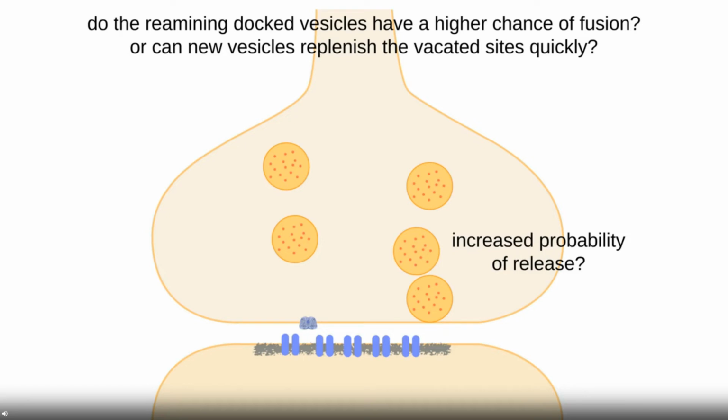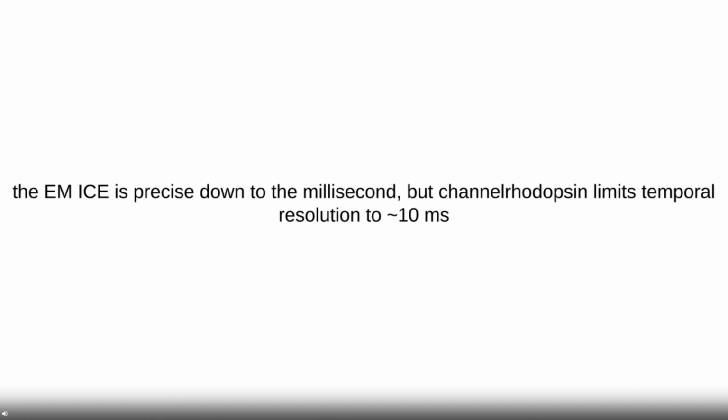So what we thought about is, in principle, a very simple idea. Well, what if you just have recovery of vesicles that's quicker? You have vesicles that dock in really quickly. But again, this isn't what Shigeki saw with his experiments, right? Docking took about 10 seconds to come back. But here again, we come to a technical limitation, which is that while flash and freeze by itself is really impressive, at this time scale, there could still be things we're missing.